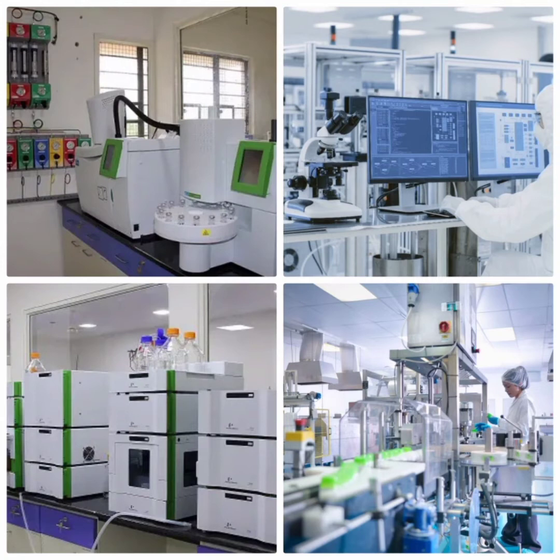Let's start with the mobile phase. As the name suggests, high-performance liquid chromatography uses a liquid mobile phase and gas chromatography uses a gas as carrier. Liquids are generally mixtures of solvents of compatible polarities, whereas in gas chromatography the mobile phase is a single high purity gas.